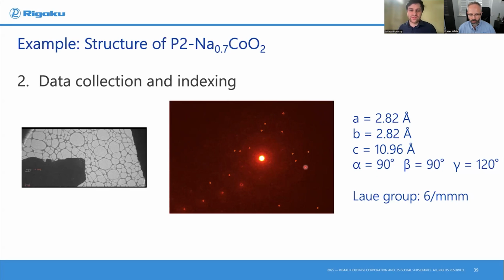And then another reason is the incomplete Ewald sphere. Sometimes you don't have the part of Ewald sphere that would make unambiguous determination straightforward. So here we focus on getting a Laue group and a unit cell for the most part. And then in the structure solution step is where we'll evaluate space groups and hopefully come up with a sensible space group. And sometimes you can see systematic absences, but just something to be a little bit careful with.